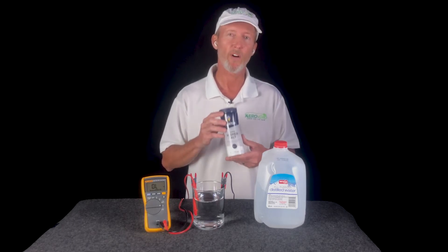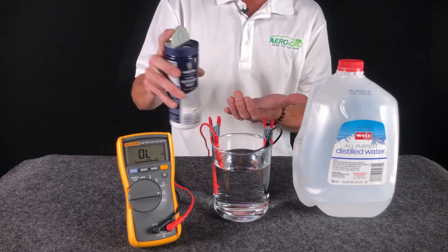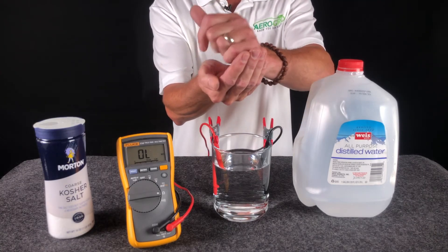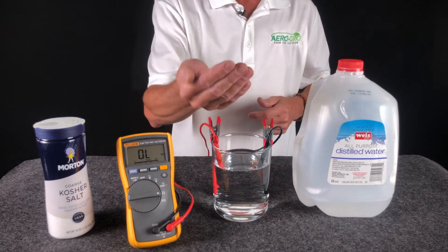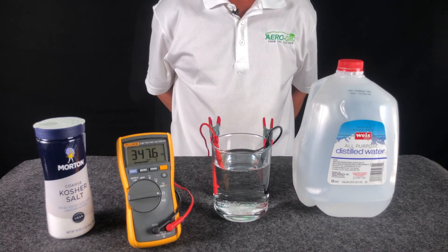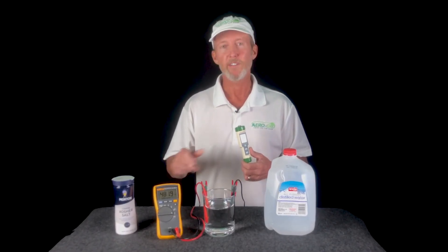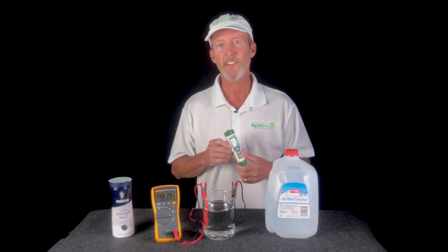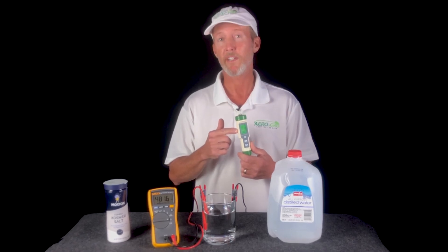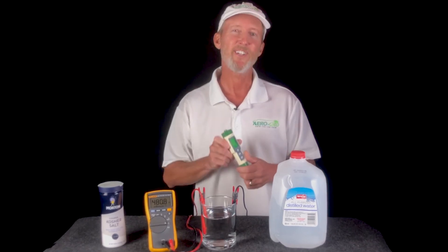That's why table salt works so well for our demonstration. I'm just going to put a little bit in my hand — that's all it's going to take. I'm just going to add it to the water. Now keep a careful eye on the numbers here on the meter. Boom — they start to go wild. Your TDS meter works exactly the same way. It first takes a reading of the water's resistance, known as electrical conductivity, and then using a formula inside of itself, it turns that number into a parts per million number, PPM, which most people agree is just easier to use. And that's how your TDS meter works.